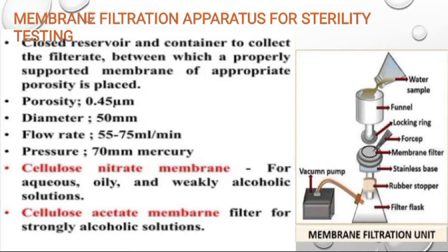Cellulose nitrate membrane for aqueous, oily, and weakly alcoholic solutions. Cellulose acetate membrane filter for strongly alcoholic solutions.